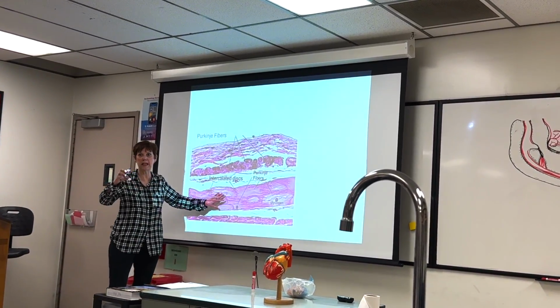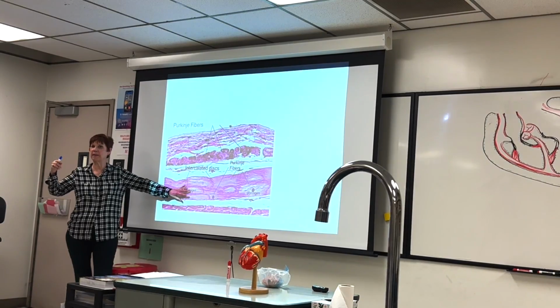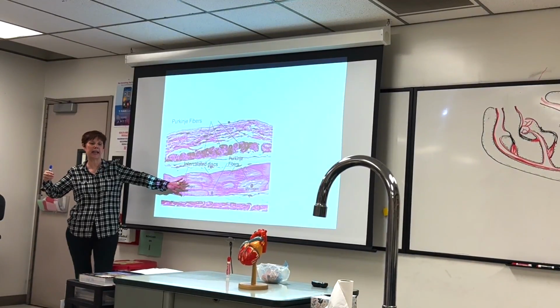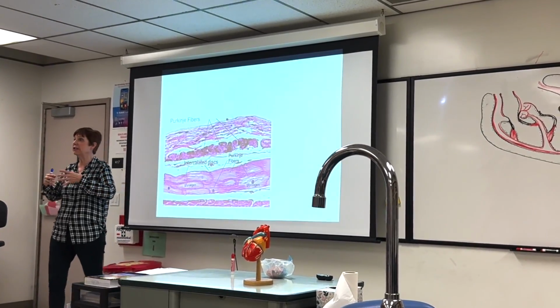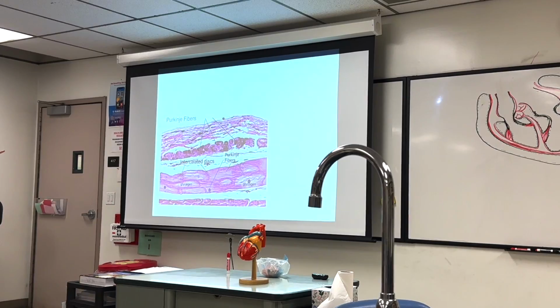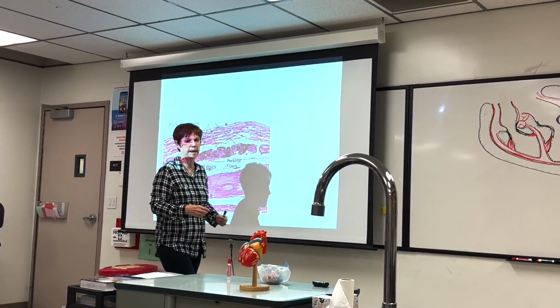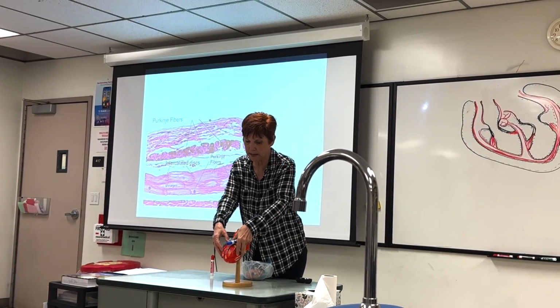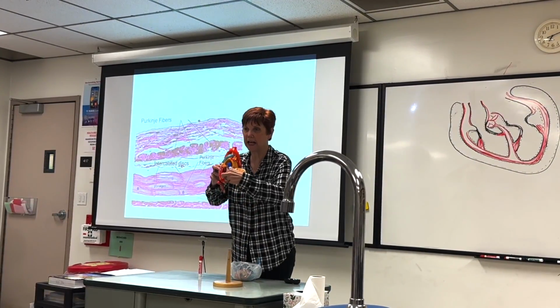Remember how swollen and white the uterine gland tissue became after ovulation? Because it would supply glycogen if there was an implantation. And these muscle cells have that similar swollen white look from the glycogen that's present there. Okay, these Purkinje fibers are the ones that, again, we'll talk about next week, but you can see them in the models, at least in this particular model, as the white lines forward.